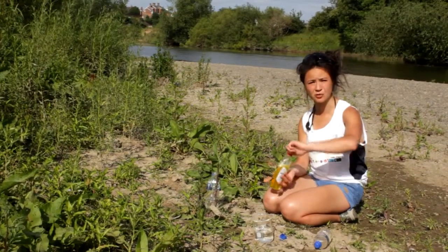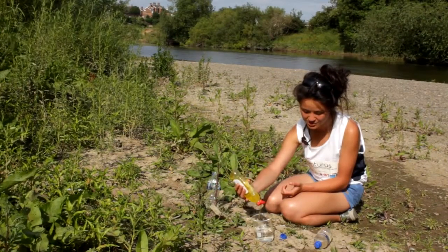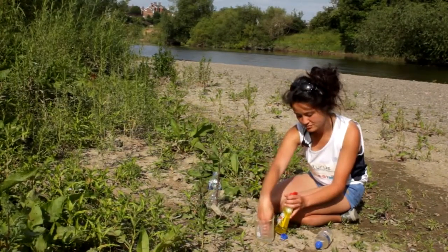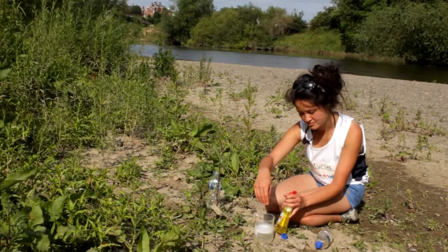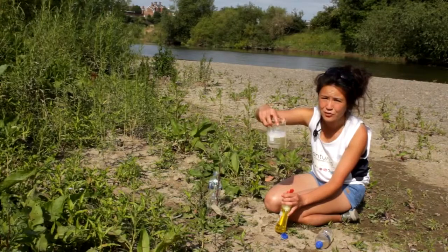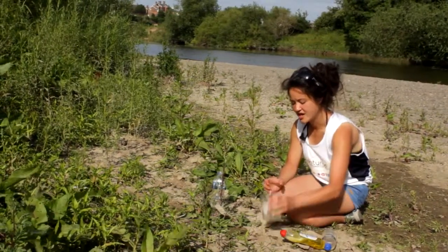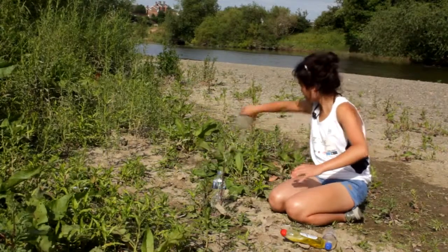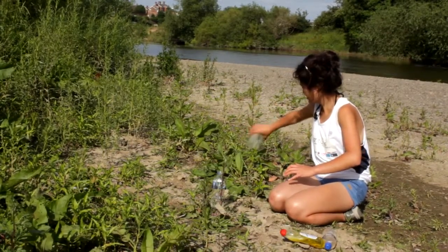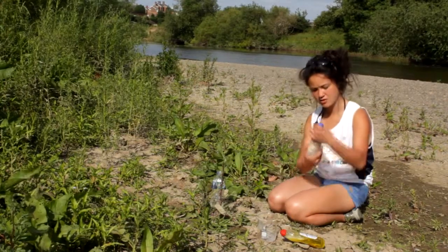I'm just going to do a couple of squirts and see how long it takes to lather. So there's 1, 2, 3. So that's these 3 that it took. You can see there's a permanent lather that's formed on that. And unfortunately I can't really wash this out, but you can at home.